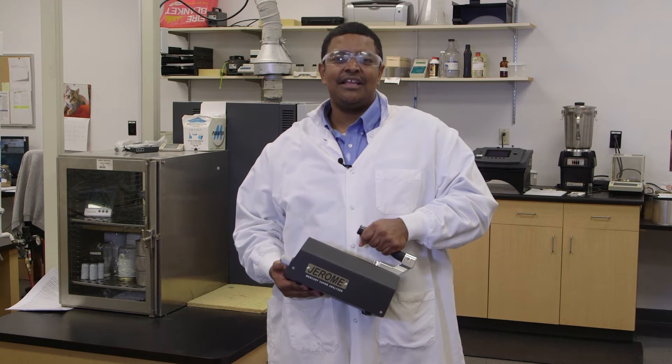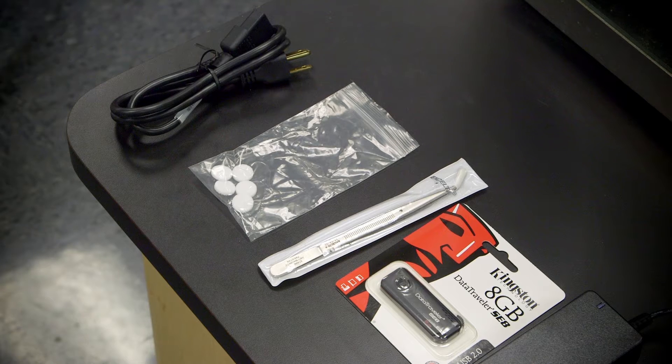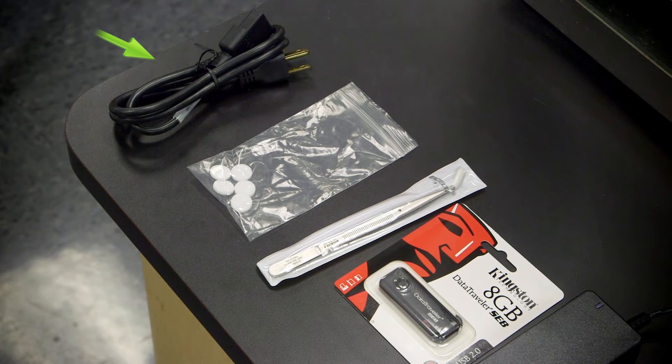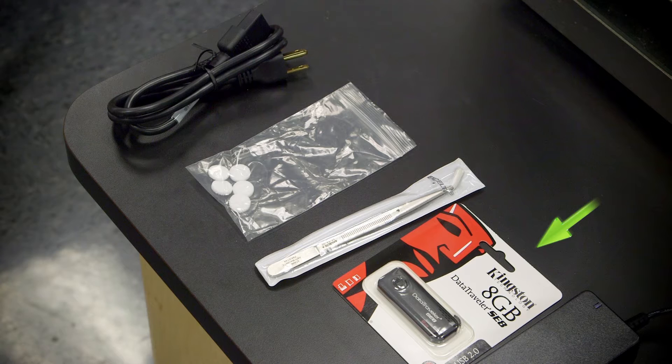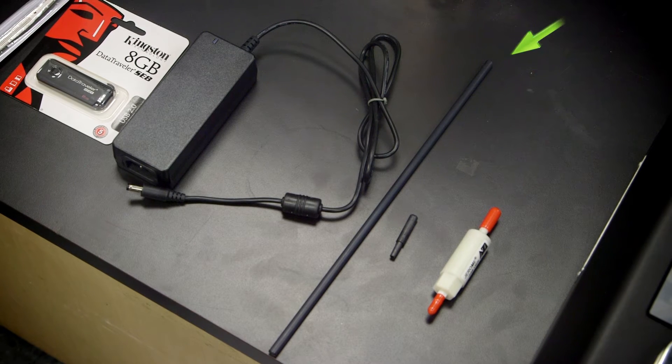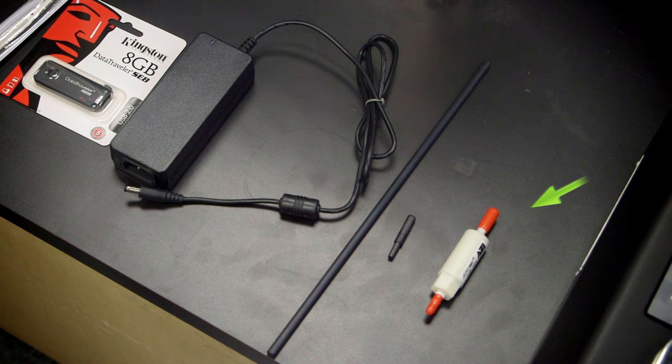Congratulations on your new Jerome J505. Before we begin, let's make sure you've received everything on your packing list. The accessory kit for the J505 includes a 3-foot line cord, one pack of five fripware filters, tweezers, a USB flash drive, an AC adapter power supply, a probe, a quarter inch to one eighth inch tubing adapter, and a zero air filter.